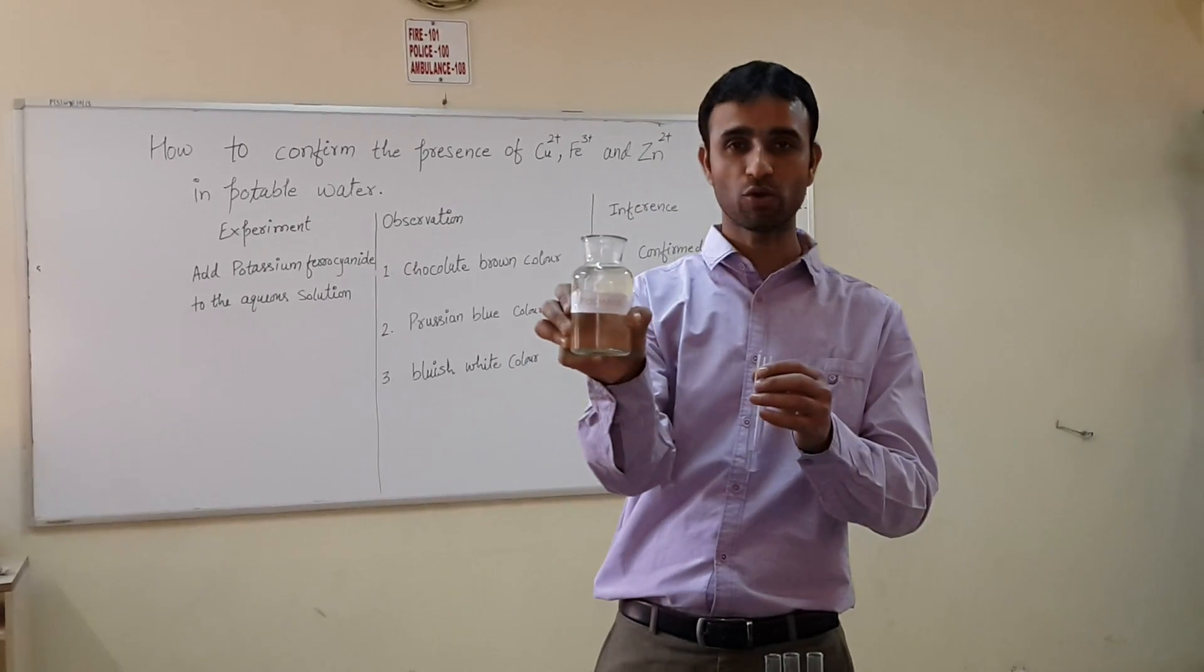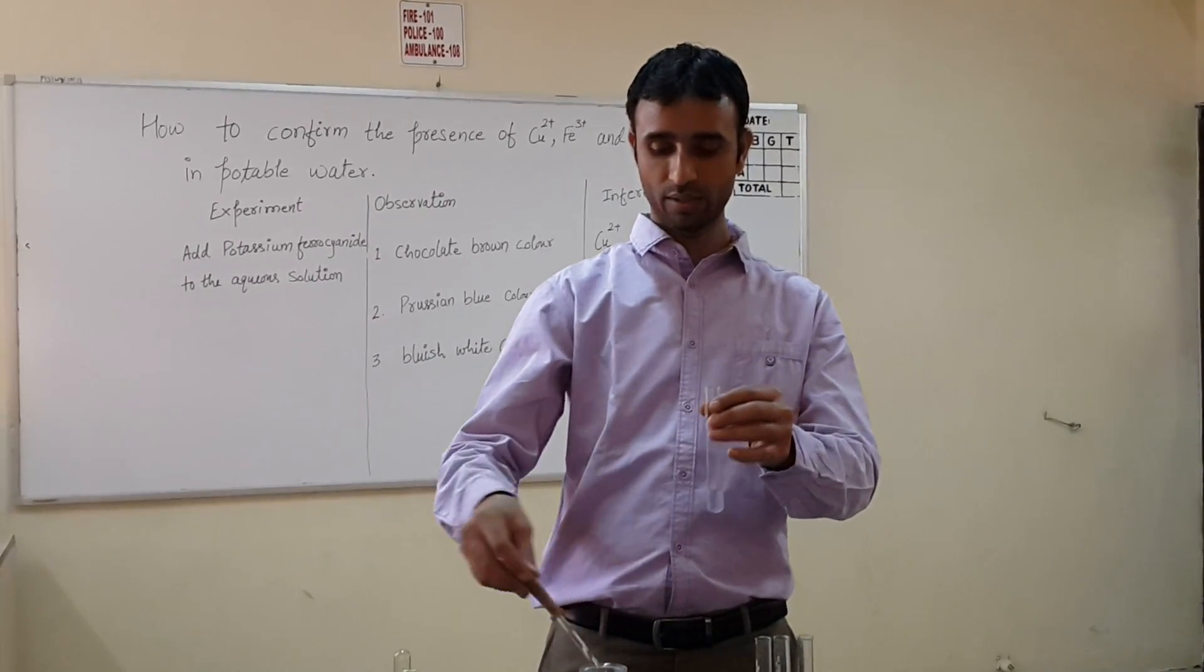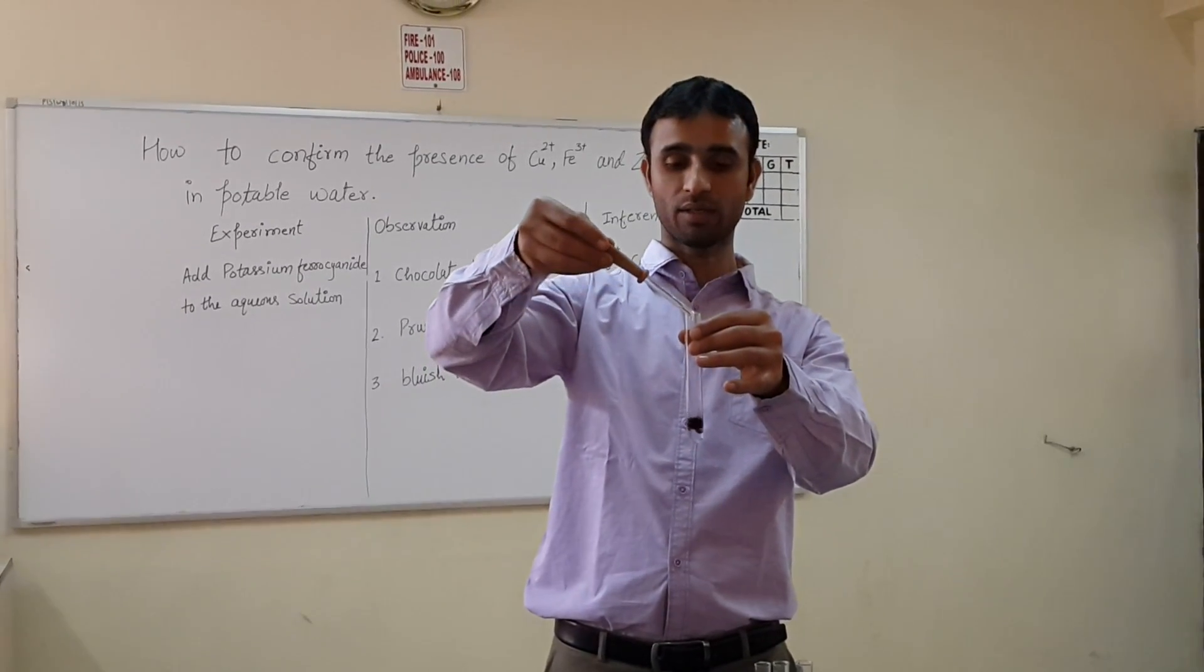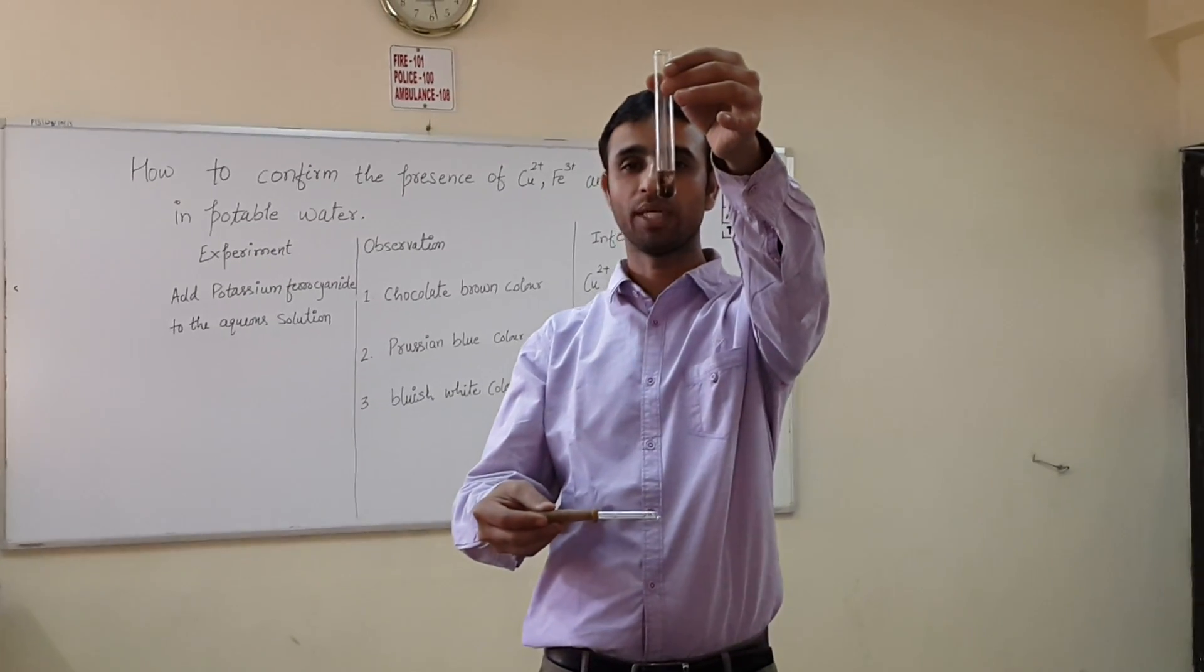This is potassium ferrocyanide. When we add potassium ferrocyanide to the first solution, see, this is chocolate brown color. That means it confirms the presence of Cu2+.